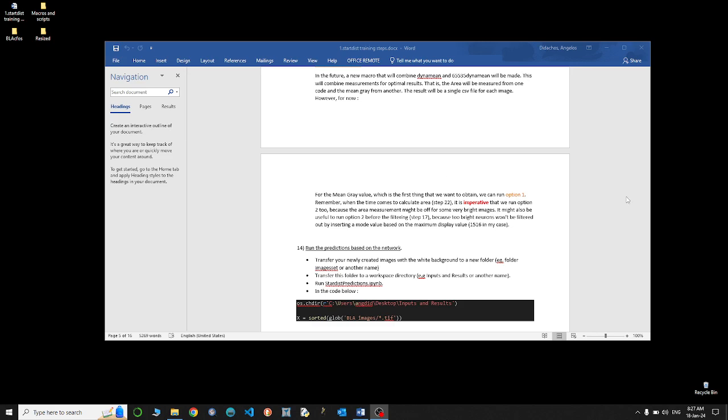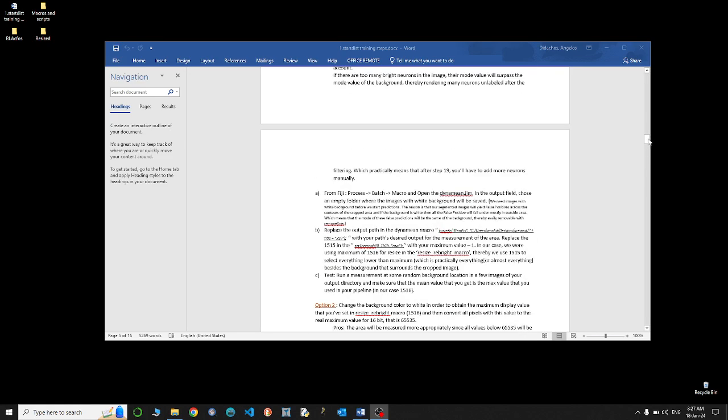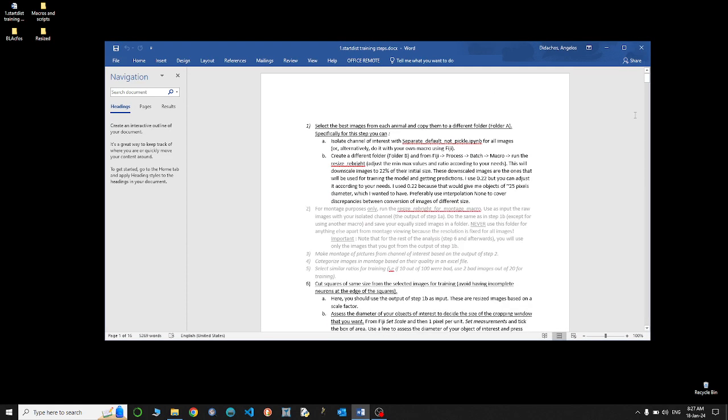Today we will go through the steps that we have to follow for the cell segmentation. So at this part, we're taking for granted that we have already completed the region segmentation, and now we want to focus on the segmentation of the cells.